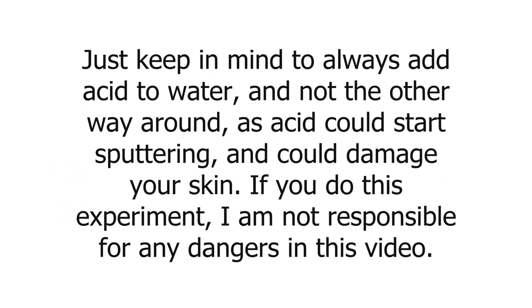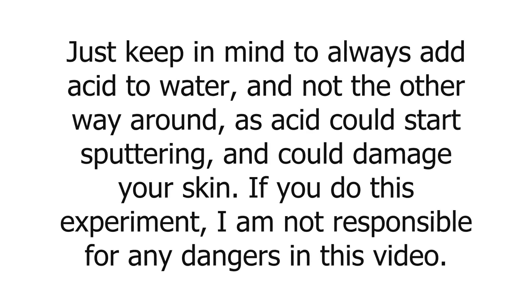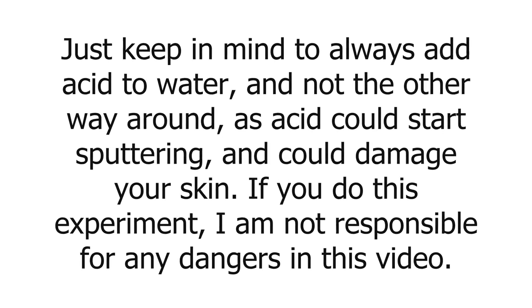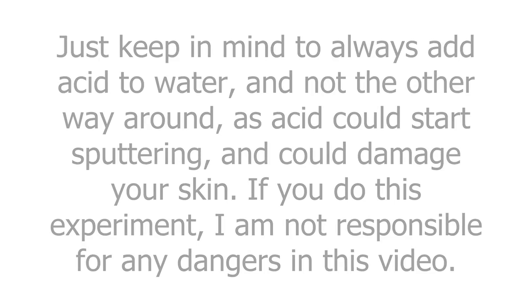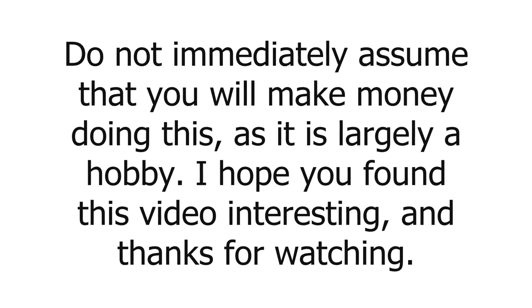Just keep in mind to always add acid to water and not the other way around, as acid could start sputtering and could damage your skin. If you do this experiment, I'm not responsible for any dangers that you may encounter. Do not immediately assume that you will make money doing this, and it's largely a hobby.